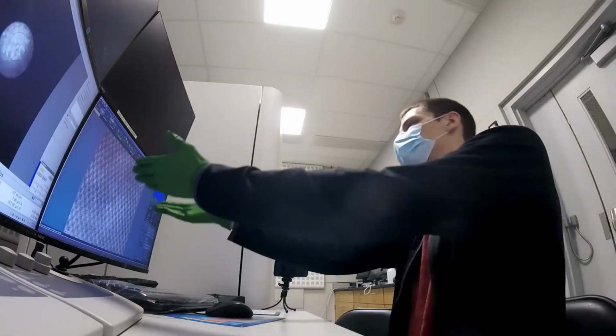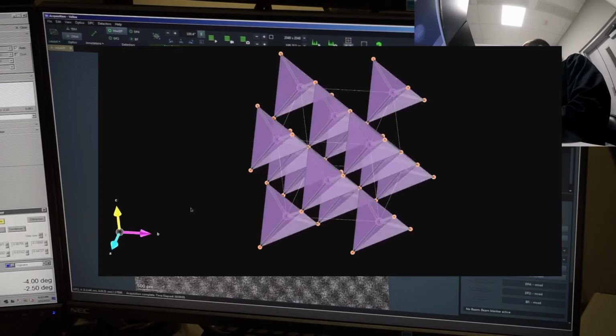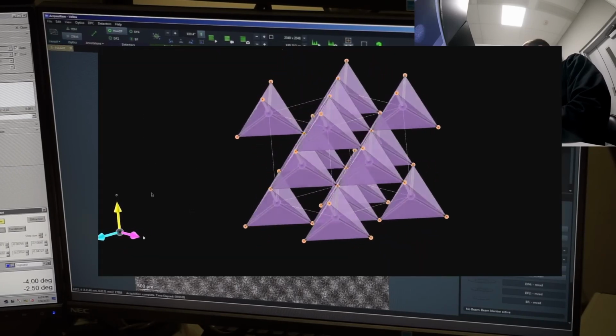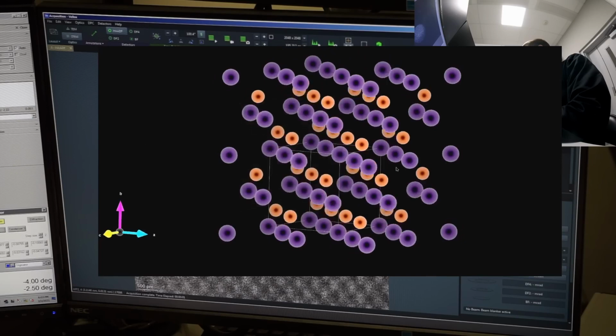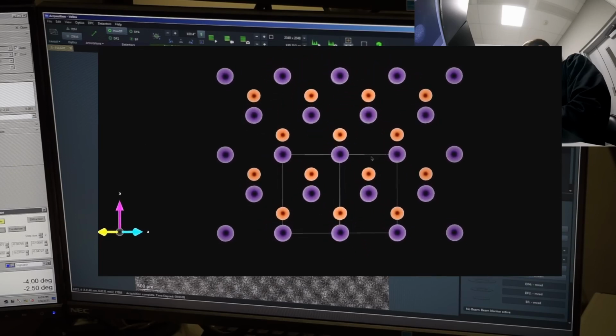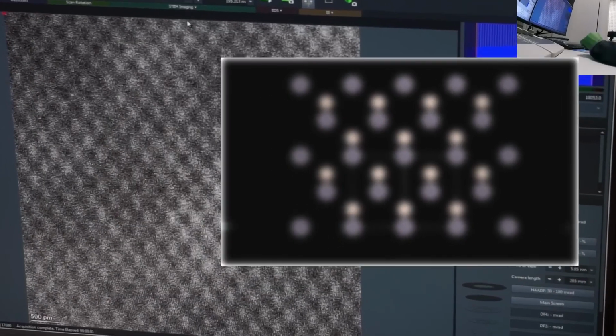There we go, look at that, atoms. These are gallium and arsenic atoms, to be precise. If you're wondering how this grid of dots actually corresponds to the gallium arsenide unit cell, like the crystalline pattern, we're actually looking at it from a diagonal, like this. And then, if all the atoms were a little bit blurry, there you go. So each of these fuzzy blobs is actually two adjacent columns of atoms. One column of arsenics and one column of galliums.